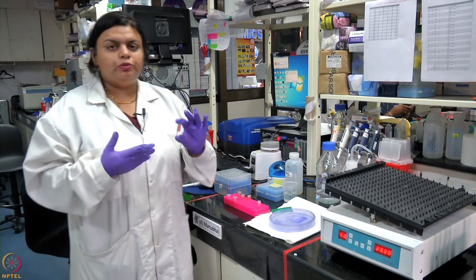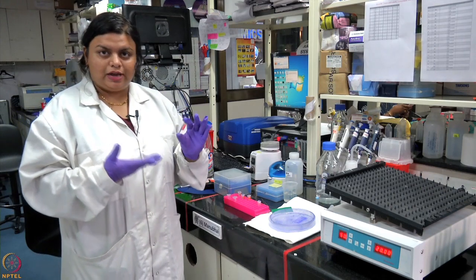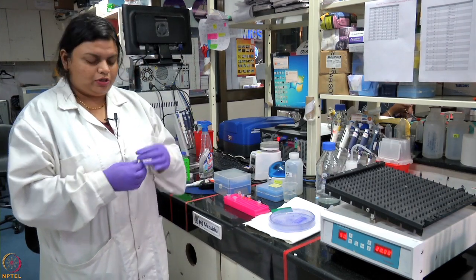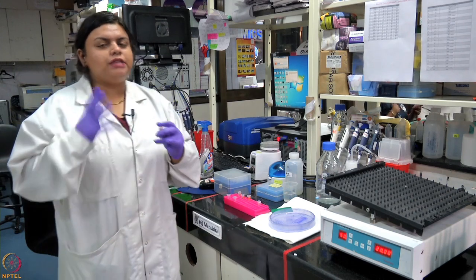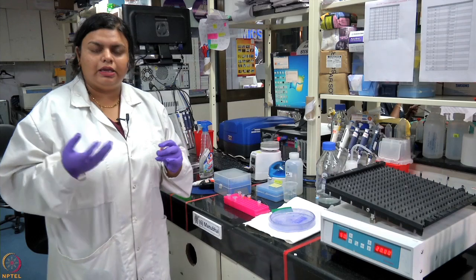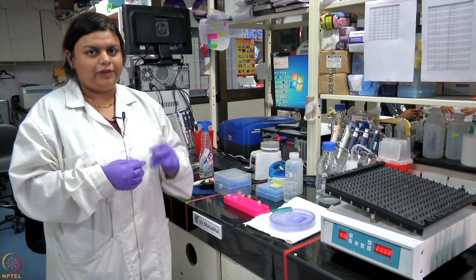For example, you want to look into a specific cell line or patient-derived tissue or tumor and you want to isolate the protein of interest. For that, we'll first take the lysate of your sample of interest. This lysate contains thousands of proteins and you do not want to have a very high background. So first, we need to do a step which is called the pre-clearing of lysate.